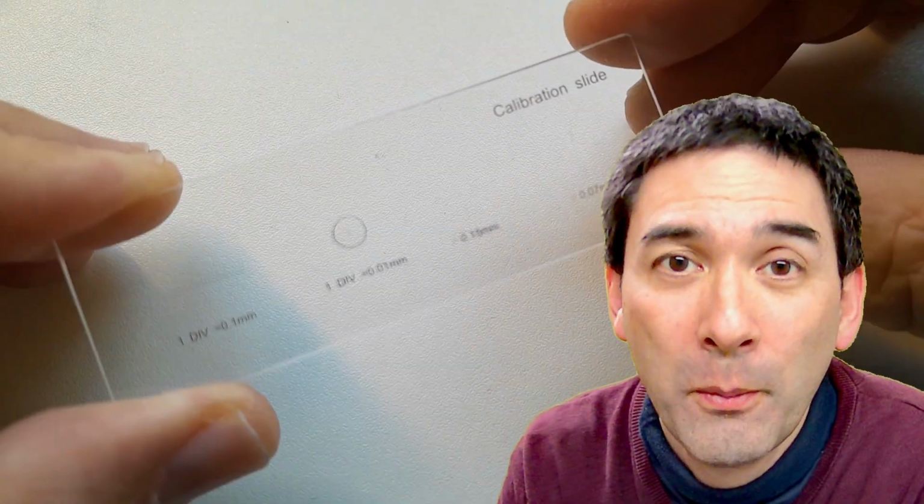And this is already now under the microscope. One line is 0.01 millimeters. Here you see it. And of course, in order to make the measurements a little bit better, I have to go to a higher magnification here. And yeah, that's basically how it looks. Then I'm going to compare the size of this micrometer scale with the size of an average foam bubble.